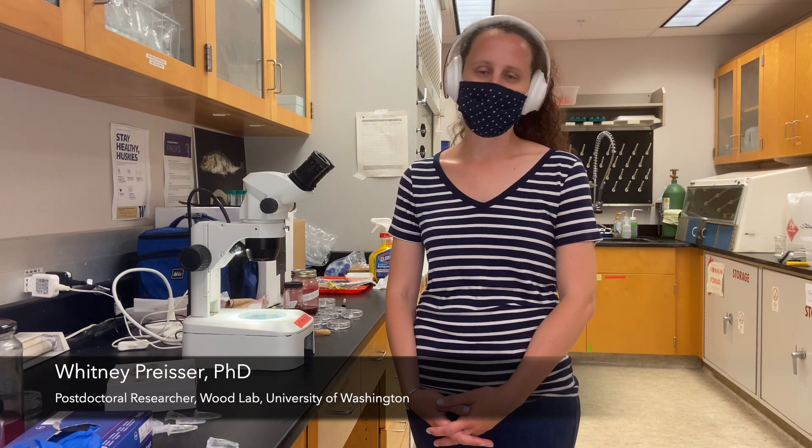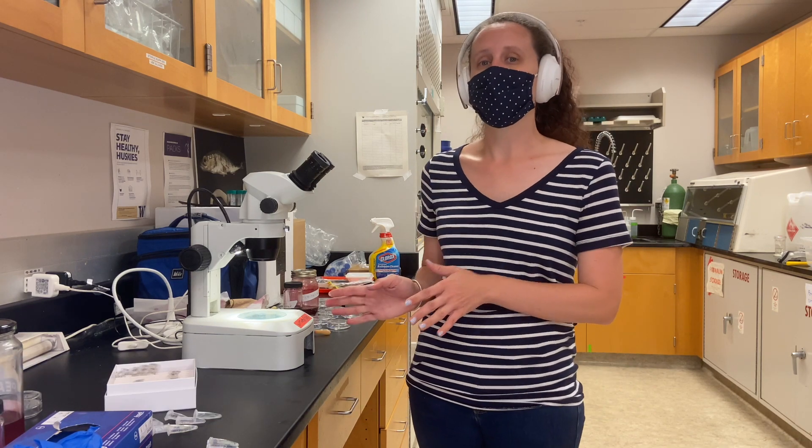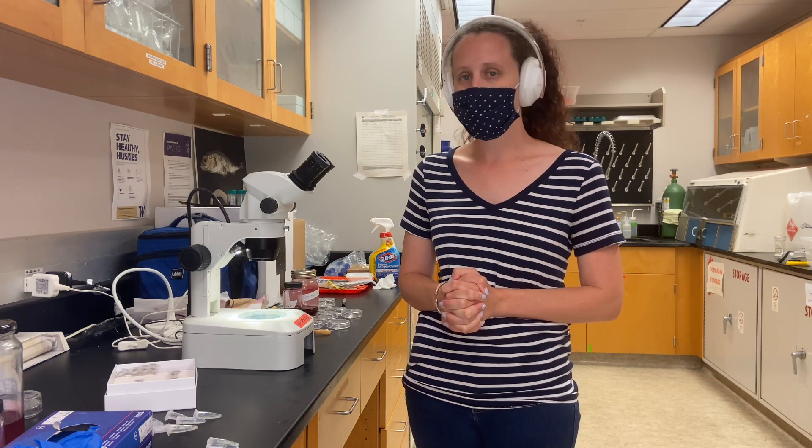Hi, my name is Whitney Chrysler. I'm a postdoc here in the Wood Lab at the University of Washington. Today I'm going to be walking through how to stain the soft-bodied helminths — the cestodes, trematodes, and sometimes acanthocephalans.